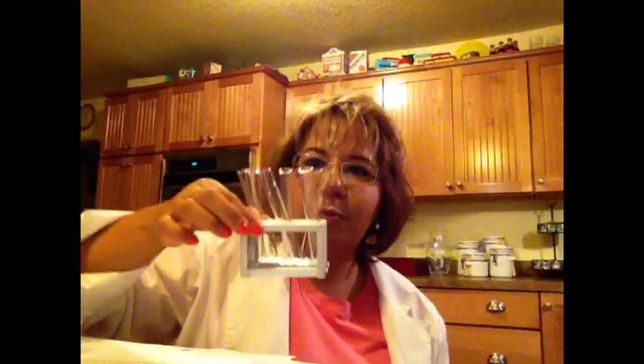You also need your graduated cylinder, which is the measuring cup that we use in the lab. Your safety goggles, of course. Your spring scale — I have mine over here with a piece of string on it, hung on a kitchen cabinet knob so it's easier to use. There's also the spatula — it's a little glass thing almost like a little spoon on the end. Your glass test tubes in the test tube rack, the magnifier, the rubber stopper, a glass marking pencil (it's unsharpened so you'll need to sharpen it — I prefer to use a Sharpie), and the test tube brush for cleanup.